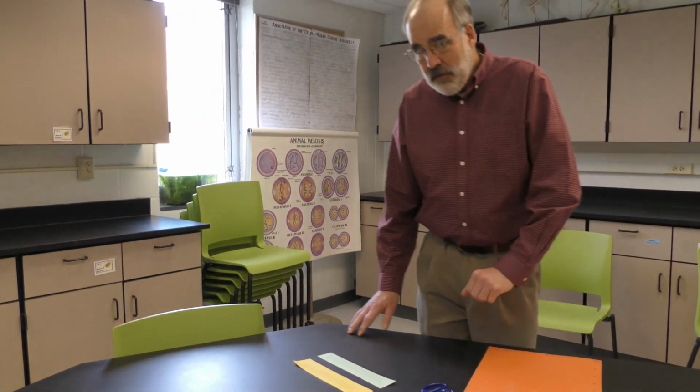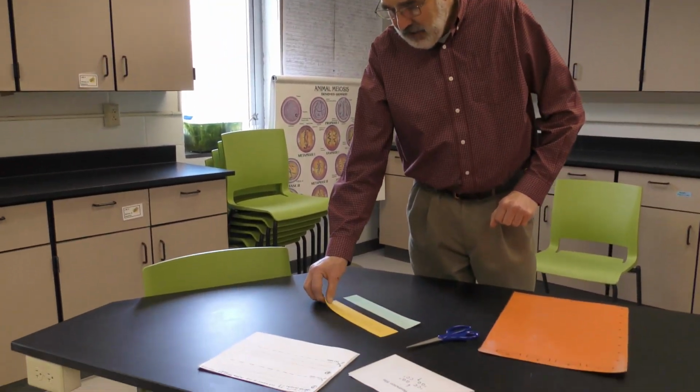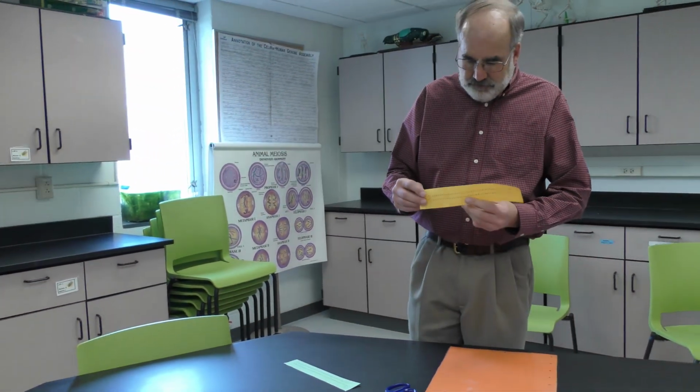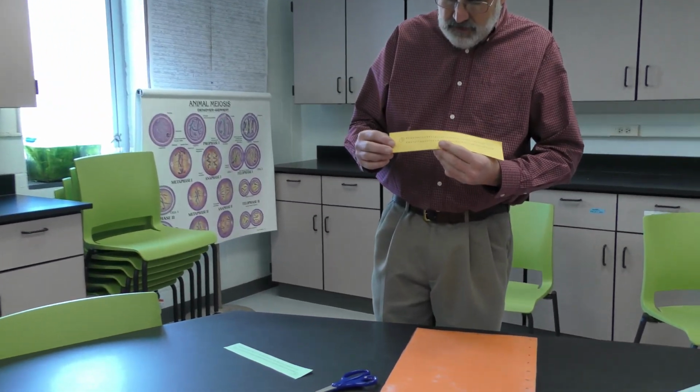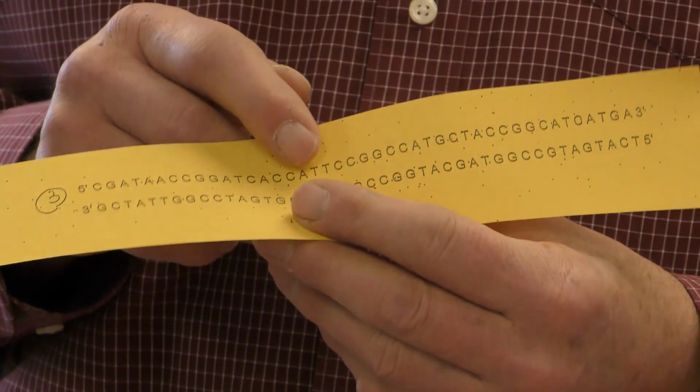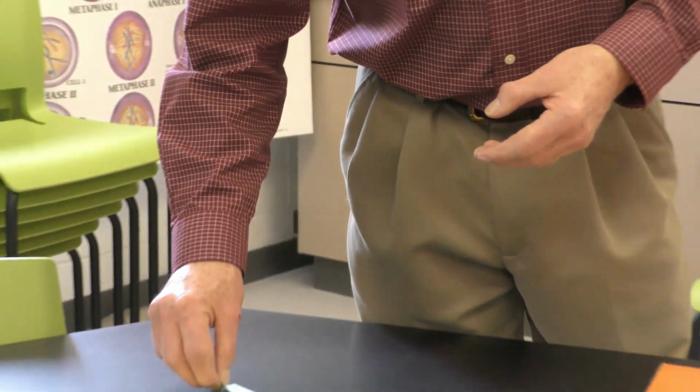Now we compare DNA 3 to DNA 4. If you look closely at DNA 3, a virus came in and inserted a random piece of DNA into DNA 3 to create DNA 4. Think about this happening all the time in the course of human history.